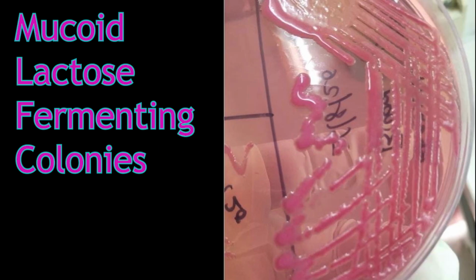Bile salts. Bile salts are used to suppress the growth of gram-positive and fastidious organisms. Bile salt also gets precipitated around the colonies when there is growth.